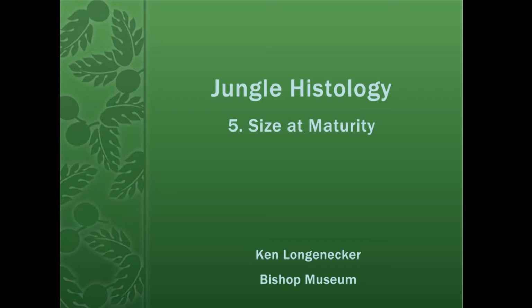This is going to have a little bit different format from the 4 modules that you've seen already. First of all, we're going to take a detailed look at the methods used for microtechnique. Now, you've had a brief overview of these methods previously, but these histological methods are really so important that we want to take an in-depth look at the methodology that you'll be using. The other difference is that we're going to be joined today by a guest, my colleague Ross Langston, who's going to be explaining these methods as he performs them.